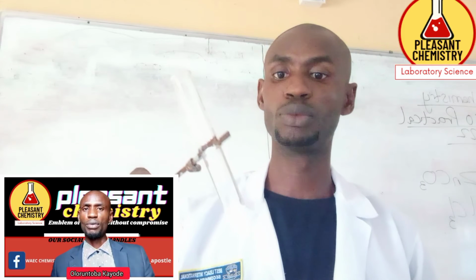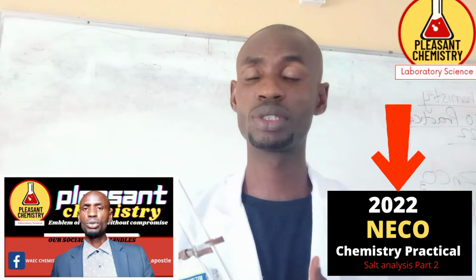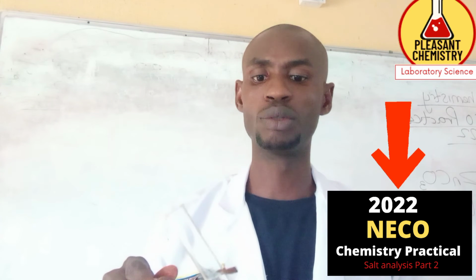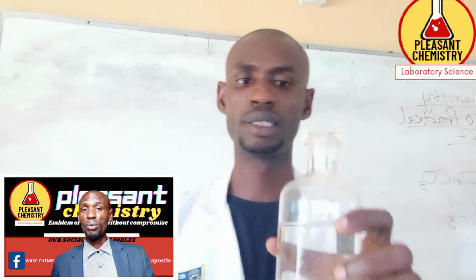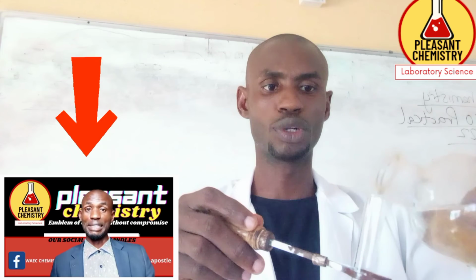So to the second portion now, we want to add aqueous ammonia. In the first portion we added sodium hydroxide, and I said that both Zn2+ and Al3+ dissolve in sodium hydroxide. Now we want to differentiate between Al3+ and Zn2+ with aqueous ammonia, and this is my aqueous ammonia. So let's add aqueous ammonia drop by drop and see what happens.